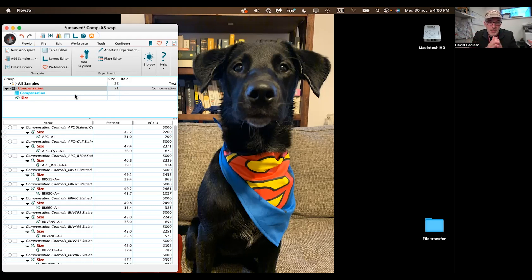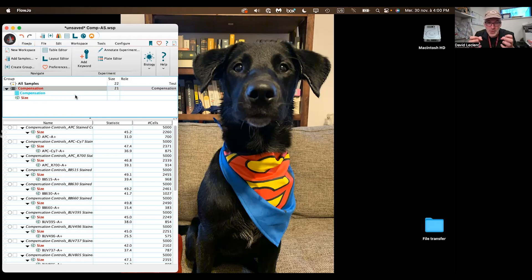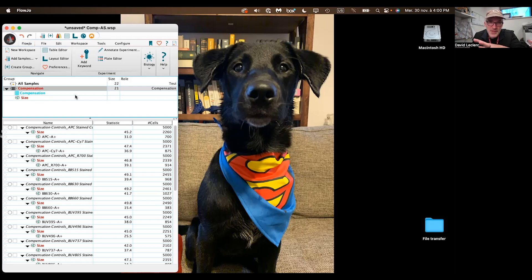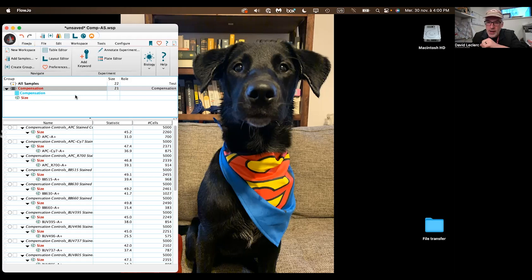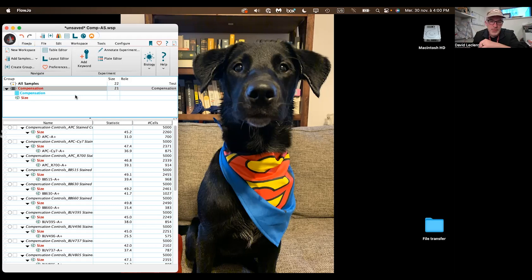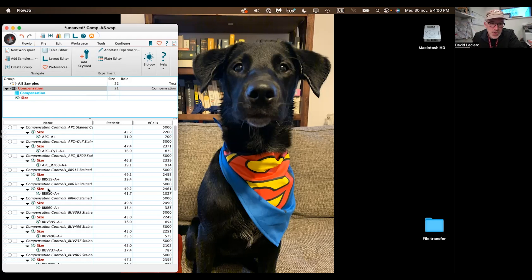In practice, it's much less work to do Autospill as well, so it's pretty great. Autospill is available currently on FlowJo, Omic, other platforms such as flowreader.io. I haven't seen it elsewhere, but hopefully it's going to branch out and be available pretty much everywhere very soon. We're going to look at it on FlowJo today.